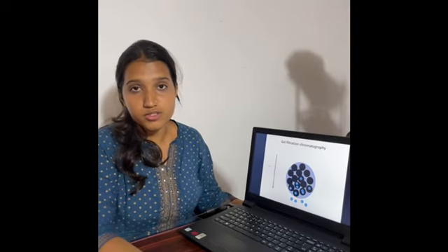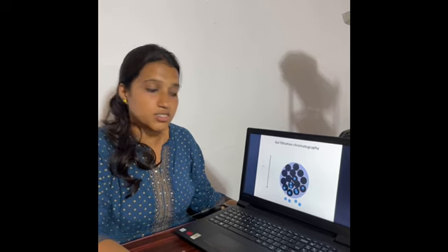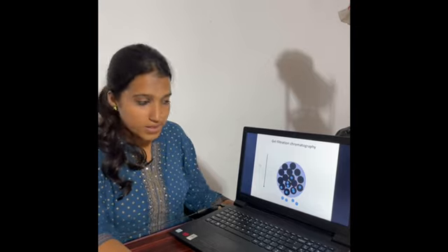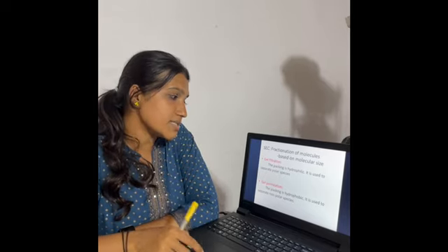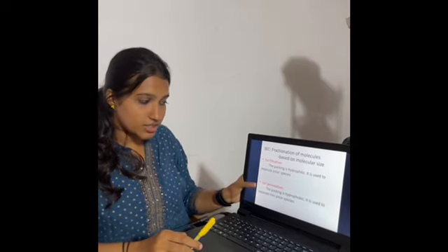If we perform the elution process by introducing mobile phase in a chromatographic column, as we see, the larger ones are eluted rapidly, then the intermediate, and lastly the smaller ones. Next, as I said before, size exclusion chromatography is a fractionation of molecules based on molecular size. It has two types: gel filtration and gel permeation.